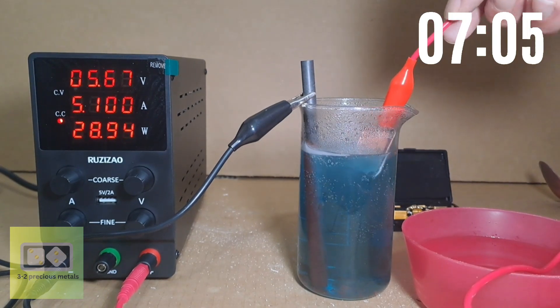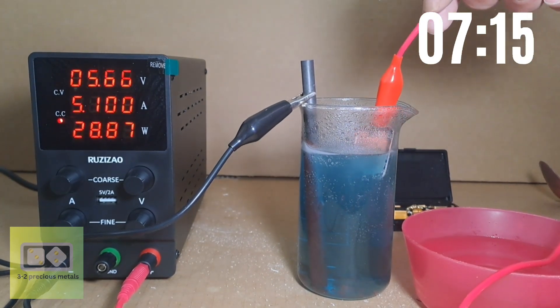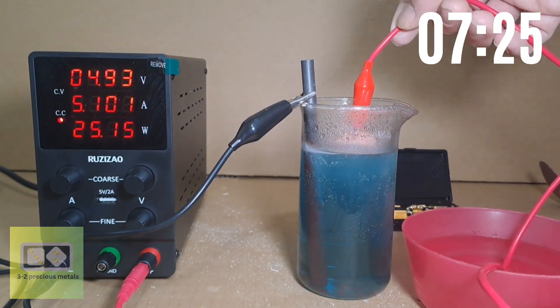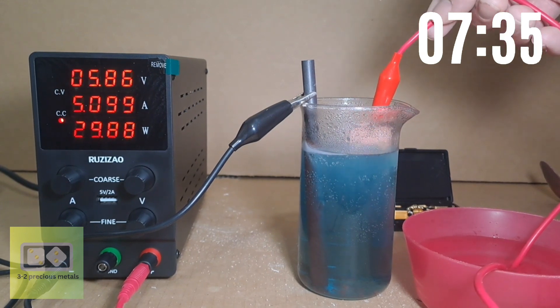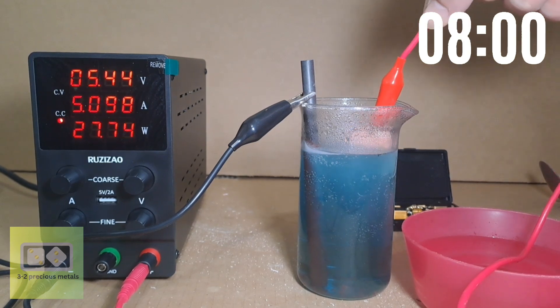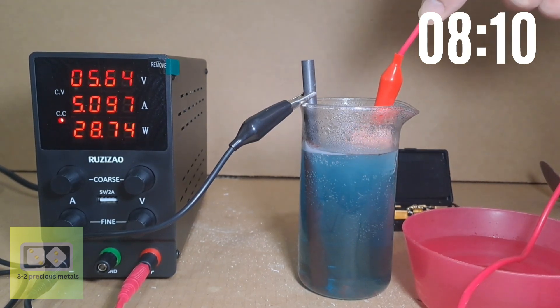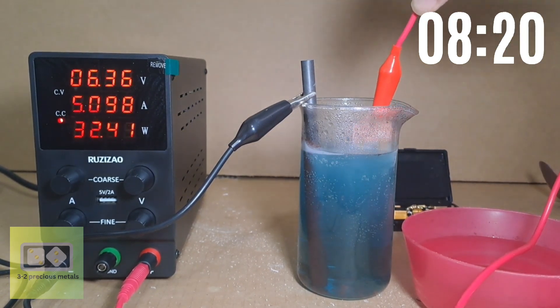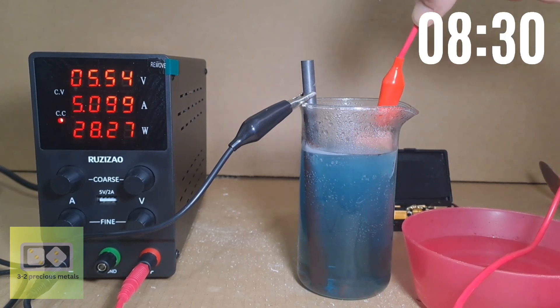As for this experiment, would I consider it a fail? The answer is no. I did manage to remove the gold using a sodium bisulfate electrolyte. Would I use this method again? Probably not. It's very time consuming for the very little gold that would be recovered.